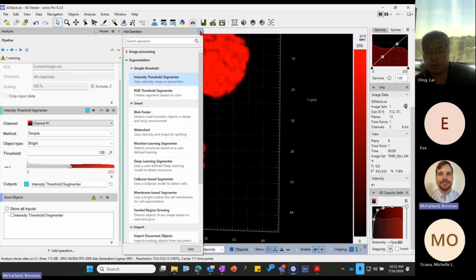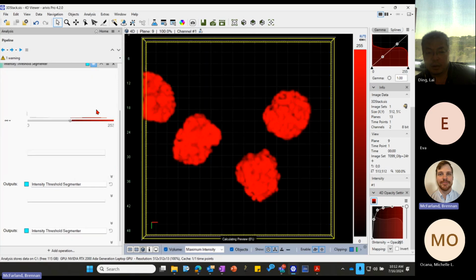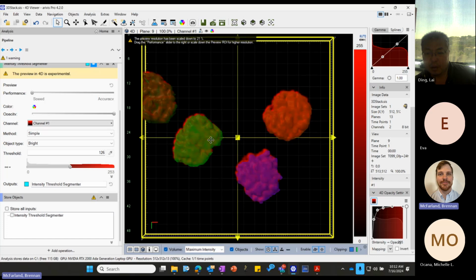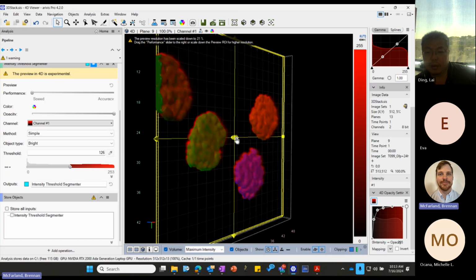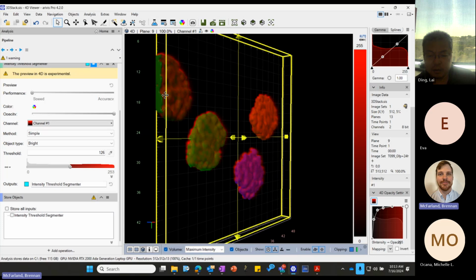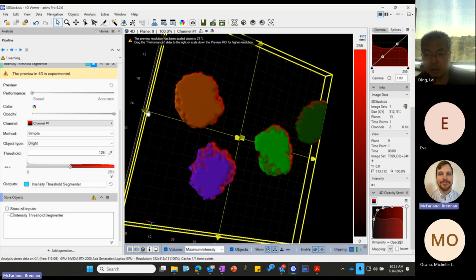And this is really just taking one feature, which is intensity, and you're segmenting based on that. So I'll go ahead and put my eyeball up here. So for something like this, and then we have our 3D viewer here. So we can drag this depending on where we want it to go. This 4D viewer preview is newer, so that's why it just says that it's experimental.